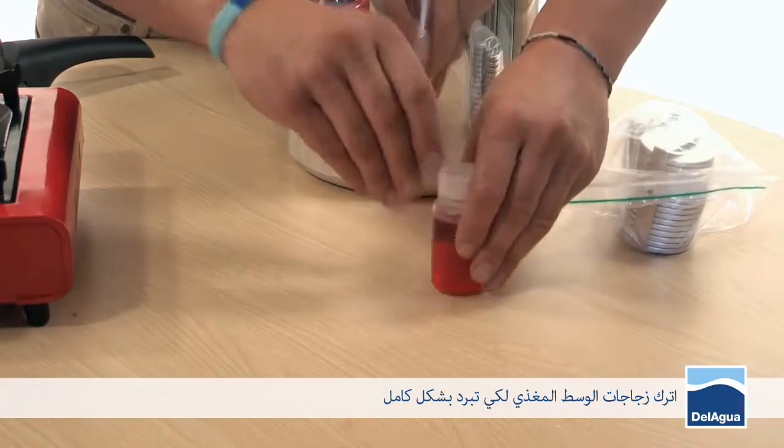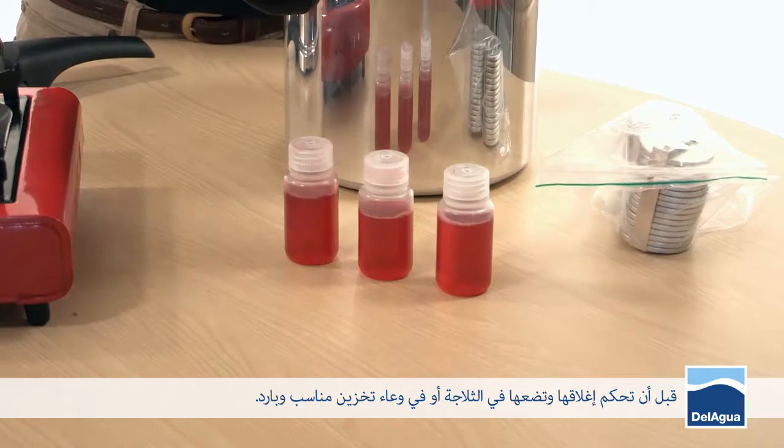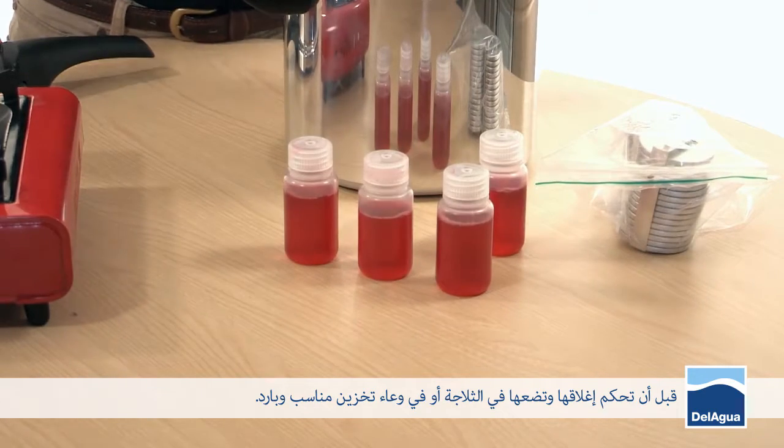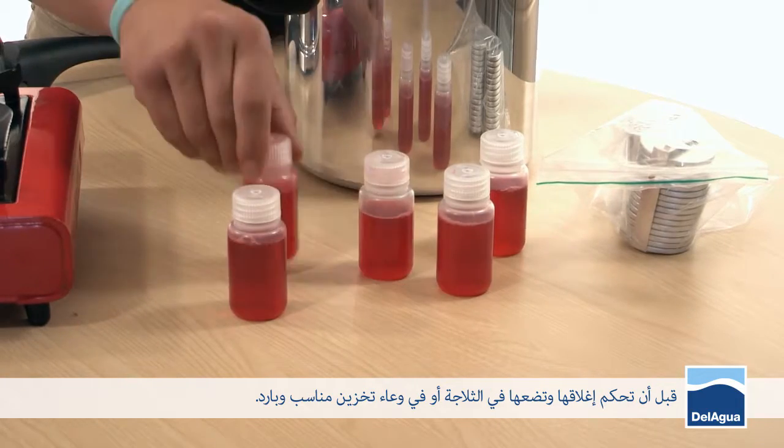Allow your sterilized media to cool completely down before you then subsequently tighten the lids, and place them into the fridge or a suitable cold storage container.